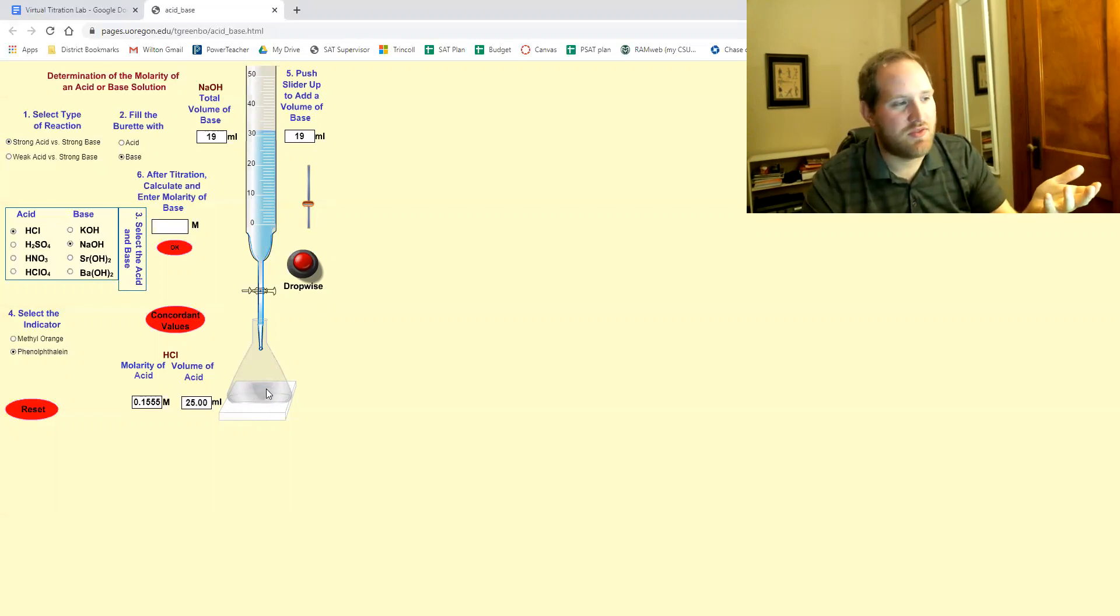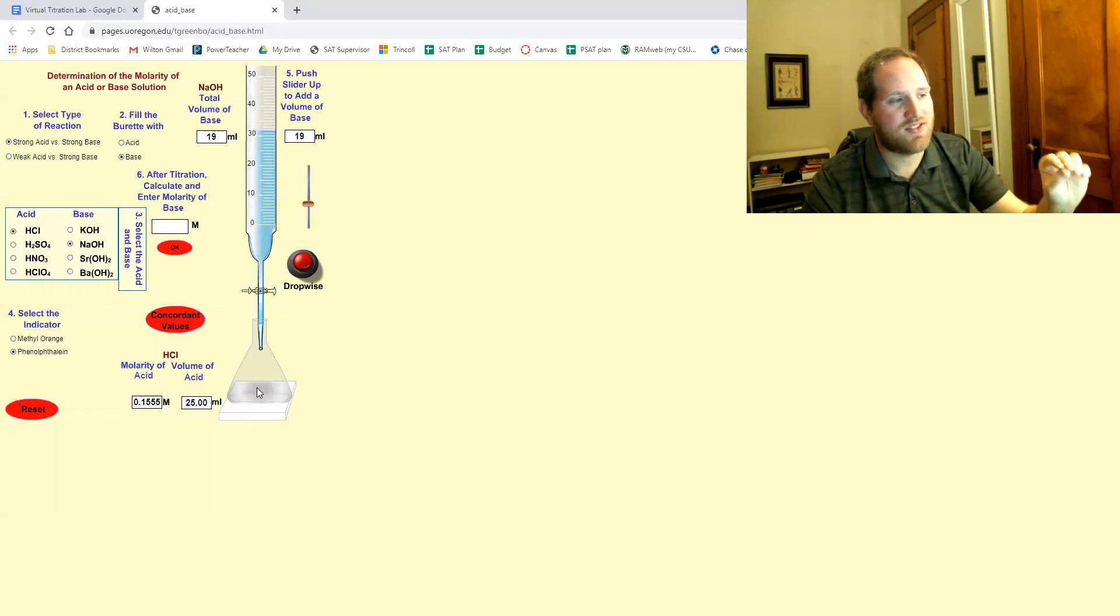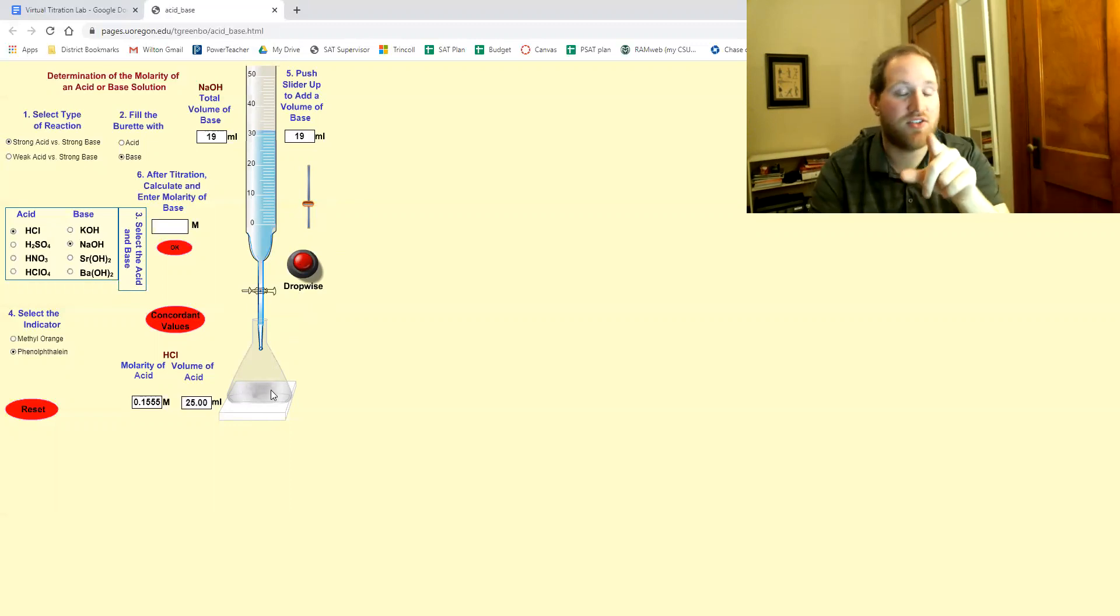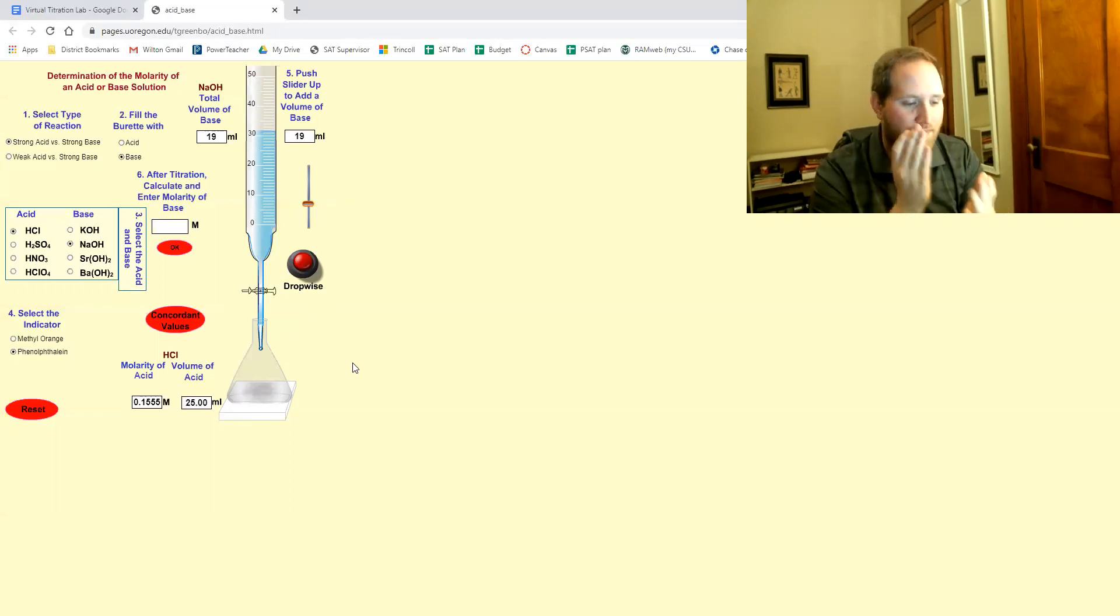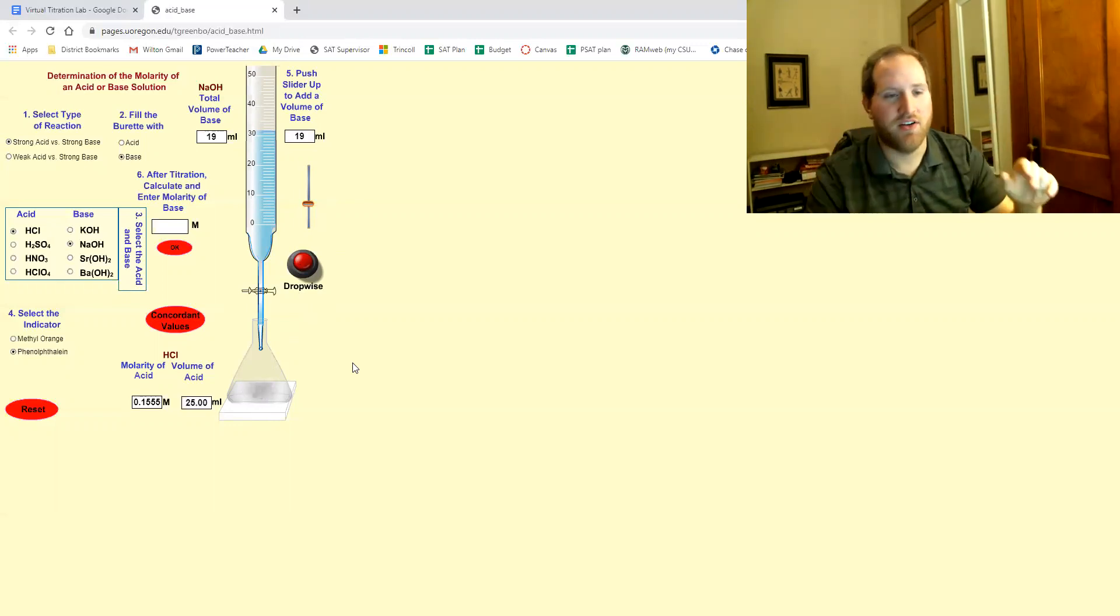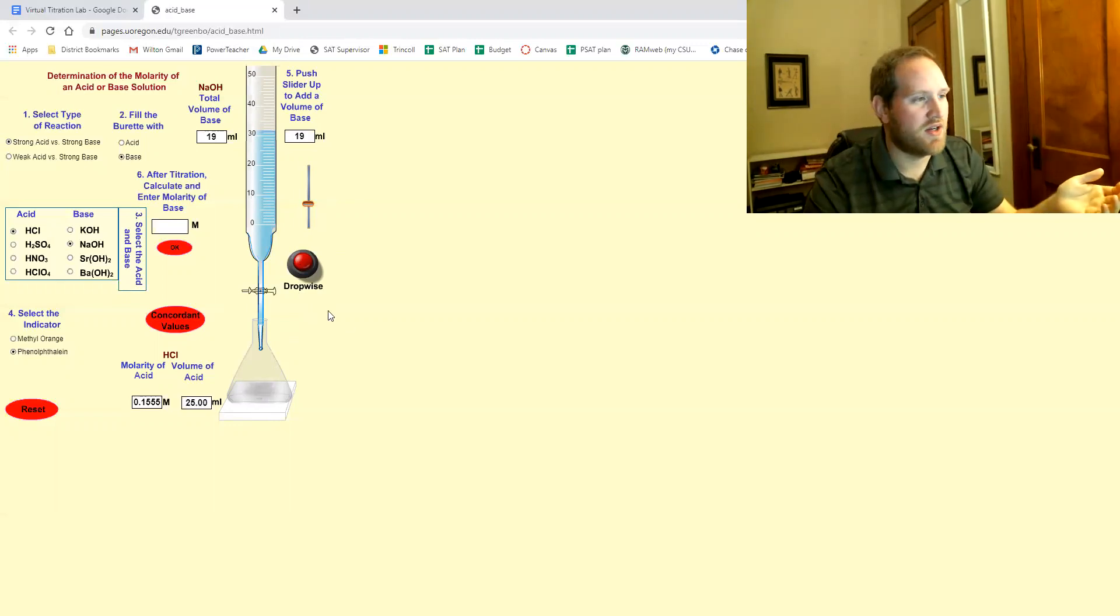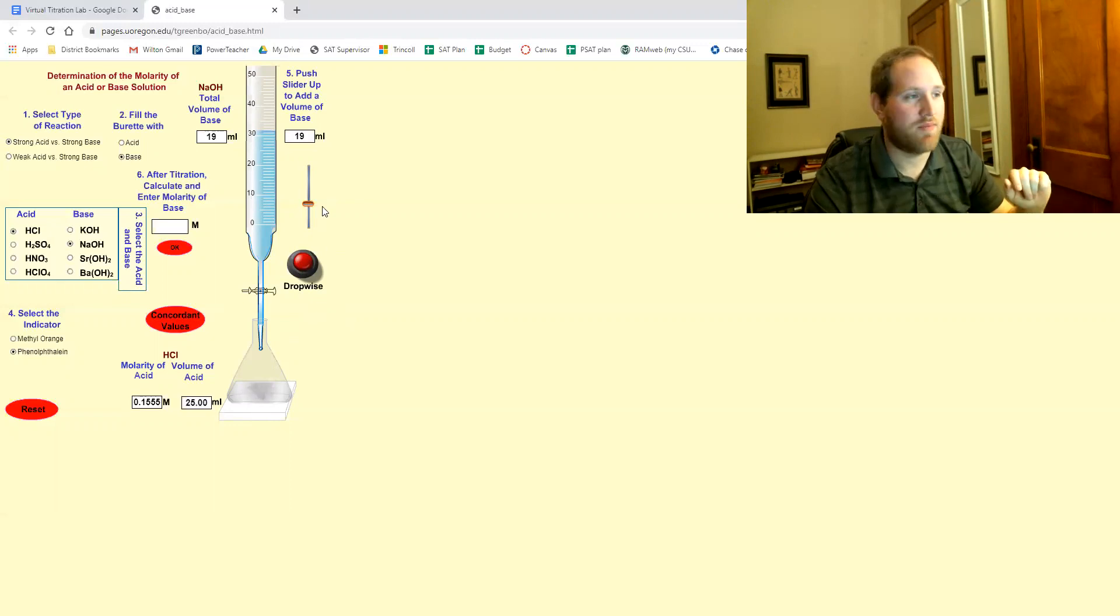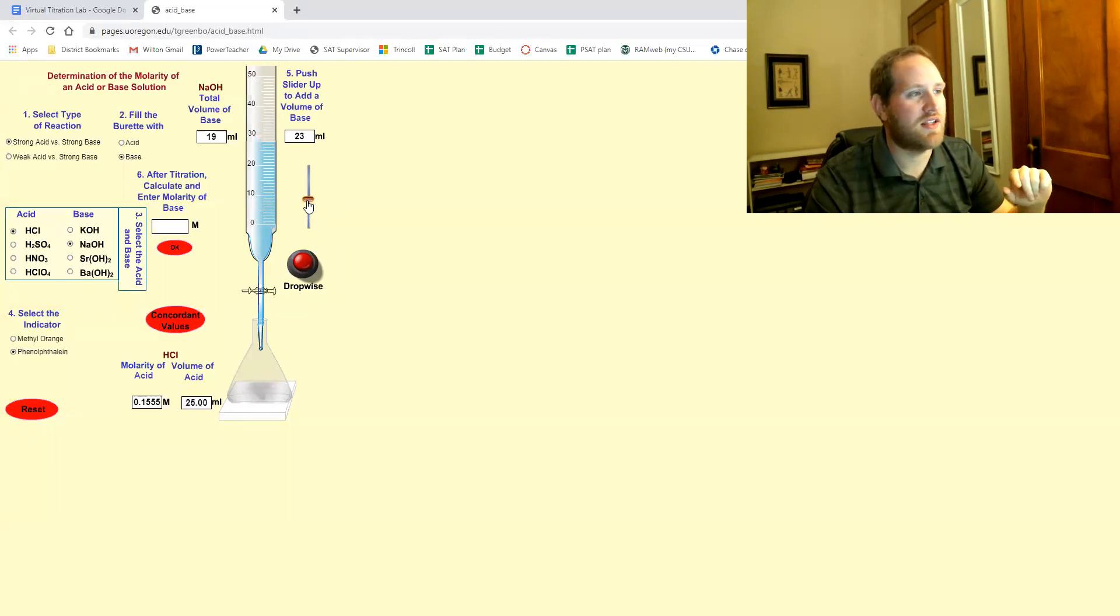If you hopefully notice a small flash of pink, that's your indicator, no pun intended. That tells you you want to hit drop wise from now on. But let's say you did that wrong and you just add another chunk like this.